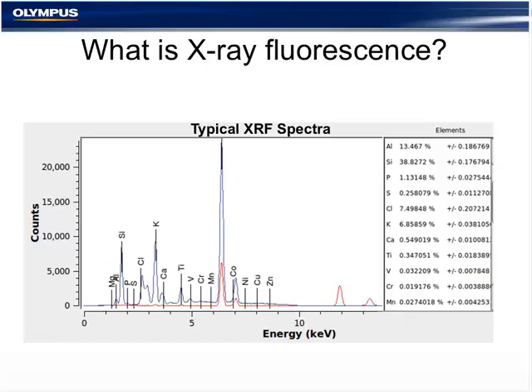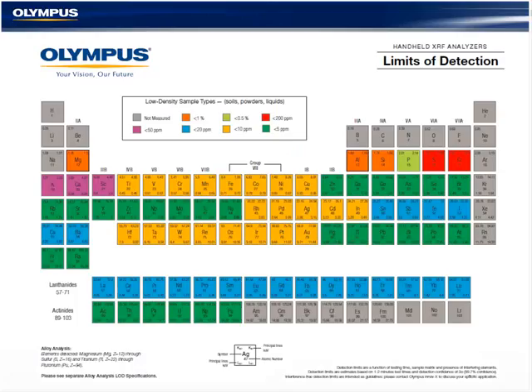Typical detection limits are shown on this slide here. Typically, detection limits will vary with sample matrix, but these are some general rules that you can apply.